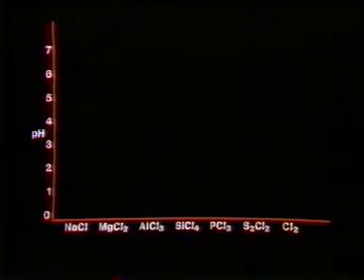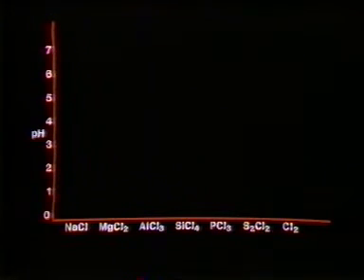You can use these results to classify the elements into metals, non-metals and semi-metals or amphoteric elements. Don't take too much notice of small differences in pH because I didn't control the concentration of the solutions. Now you should plot a graph of pH against the chloride and use it to predict the pH of a solution of chlorine.